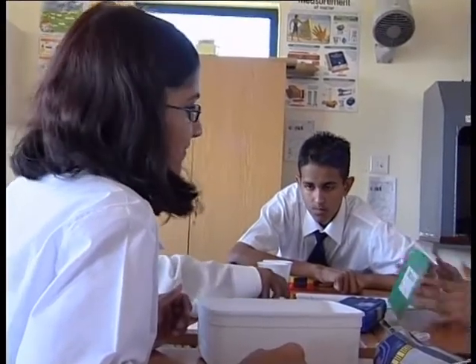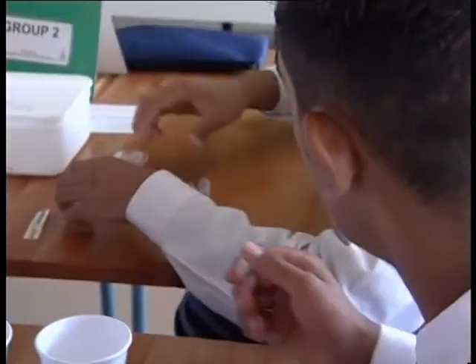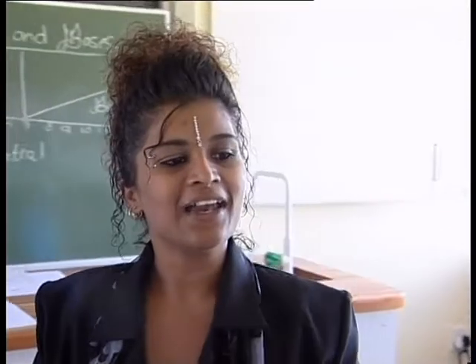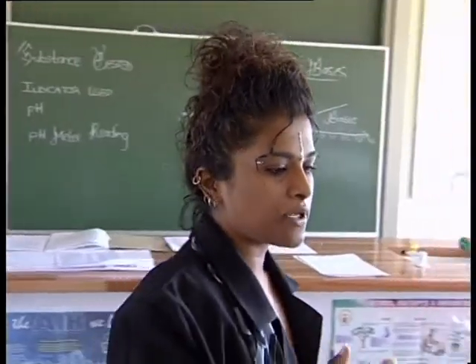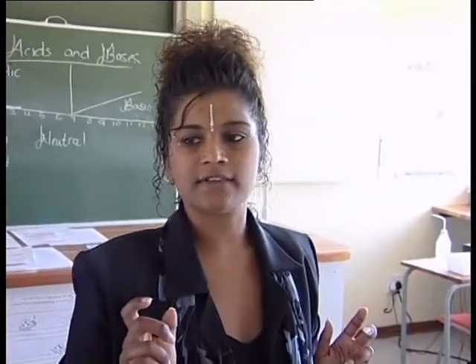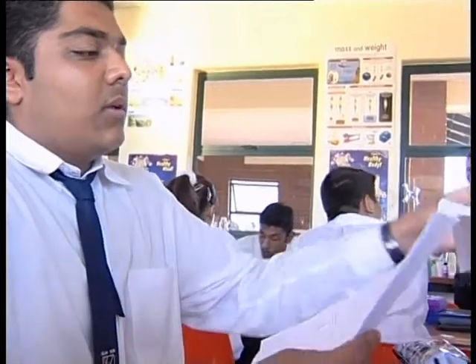Please be careful. You have acids and you have different chemicals. If the instruction says 10 drops, make sure you use 10 and not 11. Right? If you do make a mistake, use your pipette, suck up all the liquid, use a paper towel to clean your well, and you can start the activity again. Each group now starts the experiment by following the instructions on their worksheet.